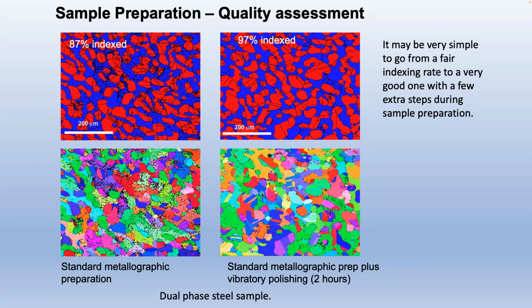So if you're not getting a good indexing rate, think about your sample prep. Think about what you can do to fix that before you go to the easy button and start filling in all these pixels.